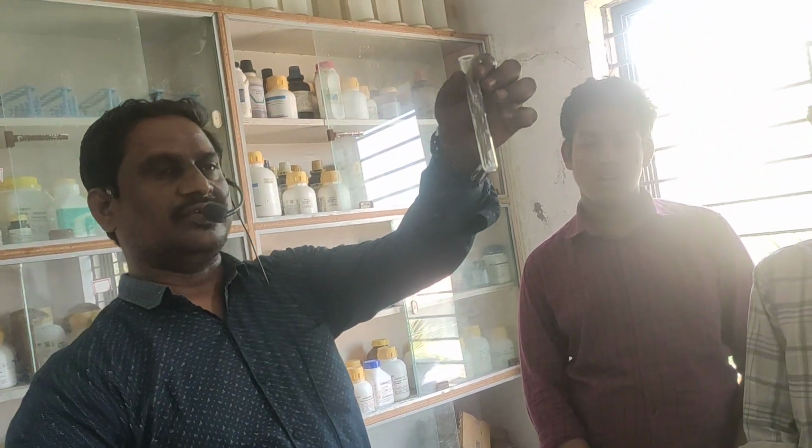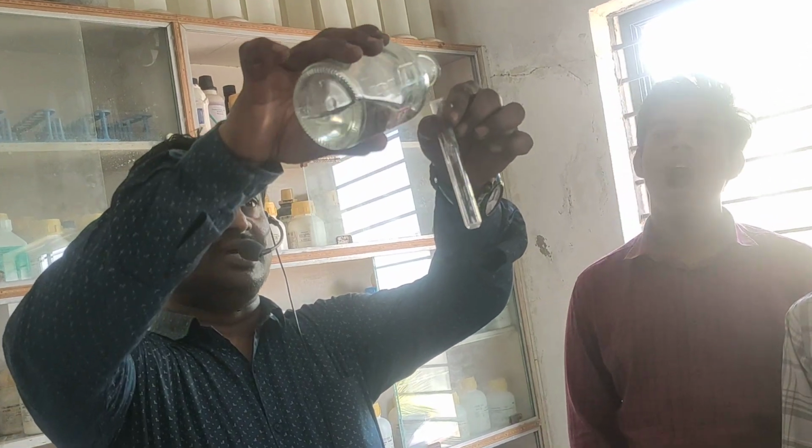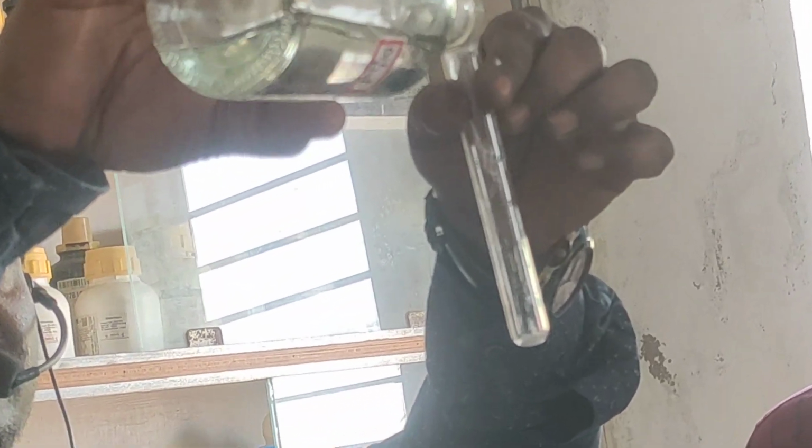Now look here carefully, all of you. For the given salt, it happens within seconds. Just observe carefully. I am adding dilute HCl. You can see it came on fast. Have you observed the effervescence? So the effervescence is coming.